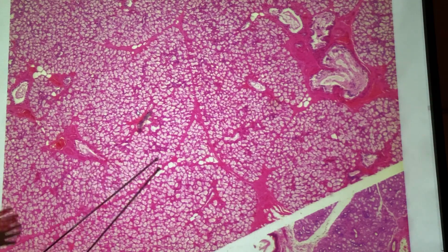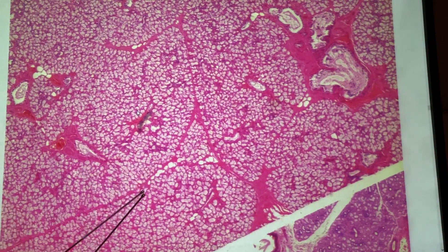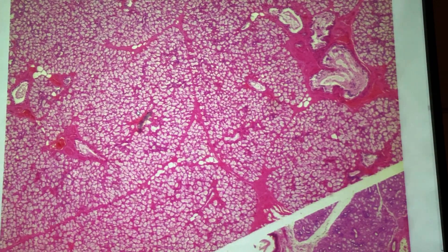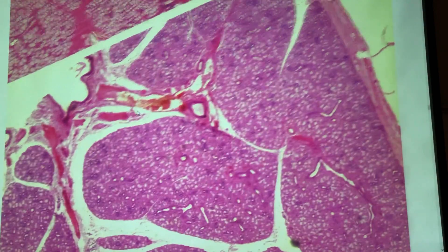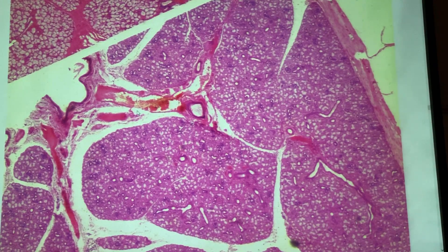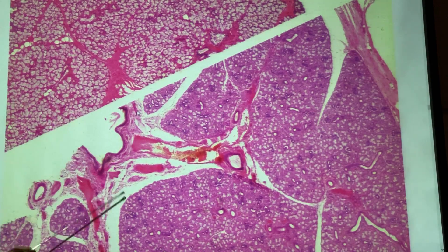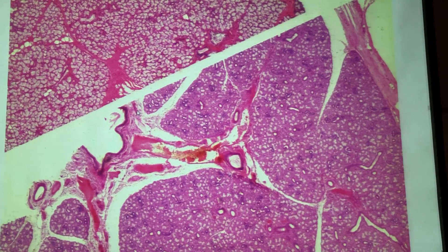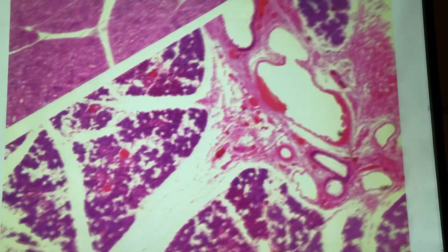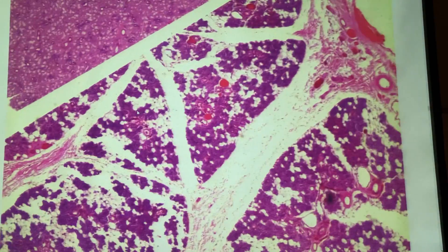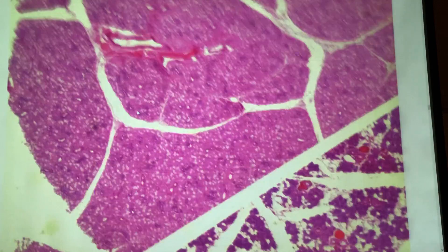This is because you're producing saliva, so there's lots of available space to store saliva before you have to use it. Now there are three different salivary gland slides, but you can see — there are two on the same screen here — there are still those open pore spaces, and lots of open space in this last one.